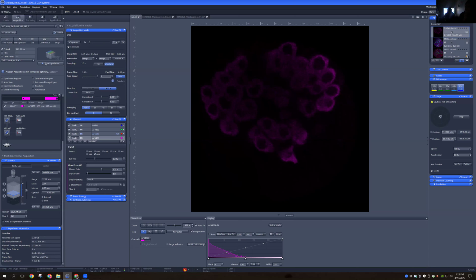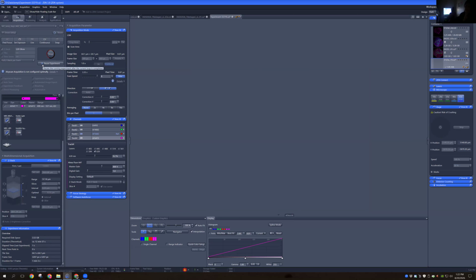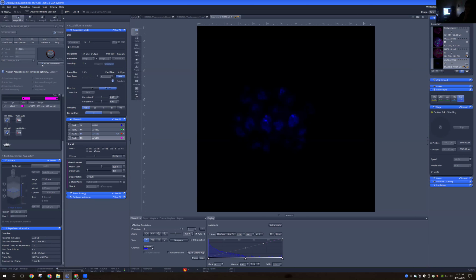Once I get this started, this is now a great time. This is why these acquisitions are great for these Shadow the Scientist sessions, because we can just chat and answer questions as we watch the images appear on the screen.